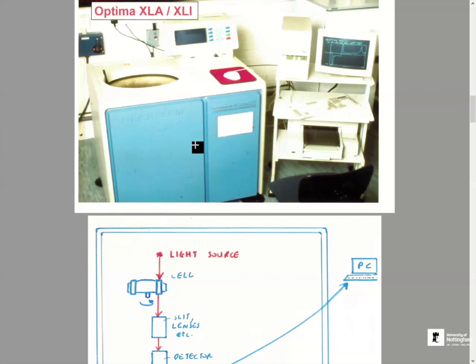and 80s, 1970s, coinciding when I did my PhD, there was a dramatic decline in interest in this sort of technology because people were using other stuff. We want to use high-resolution methods like NMR and crystallography for looking at structures and things. We don't want just shapes and things. And molecular weights, we can use electrophoresis and chromatography. And then people started to realise the limitations of electrophoresis.